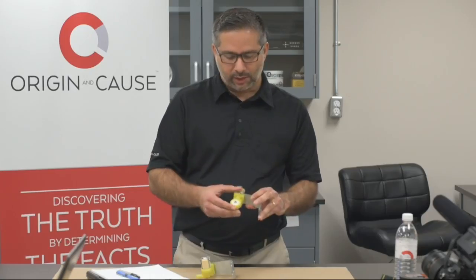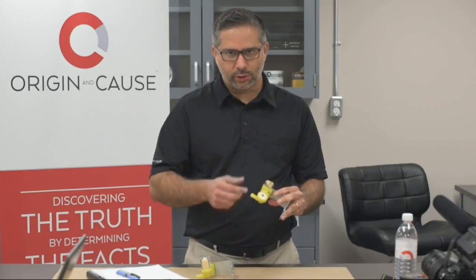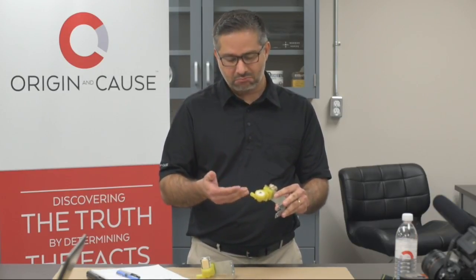So going back to the degradation itself, basically the polymer degrades, and let me show you something on the microscope, how it looks and how we use the equipment we have to determine degradation.